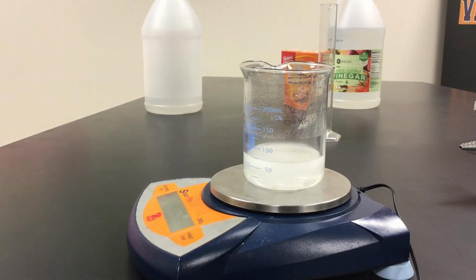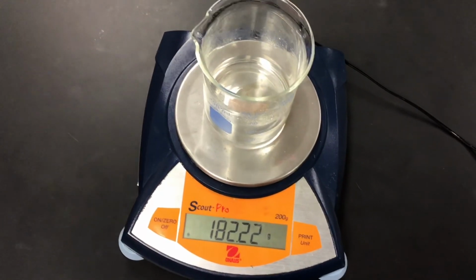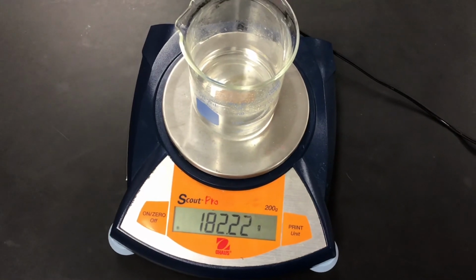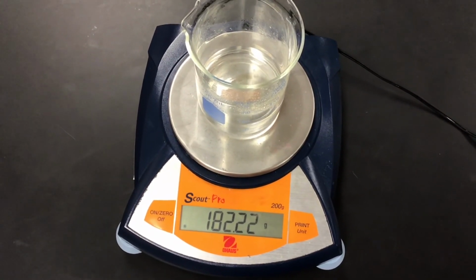Then wait for a moment, just wait until all the bubbles disappear. Throughout this process, you can use a wooden stick to stir the beaker, which might help the reaction rate. After 2 minutes, there's no bubble coming up, which means the reaction is done. Now record the total mass I end up with after the reaction.